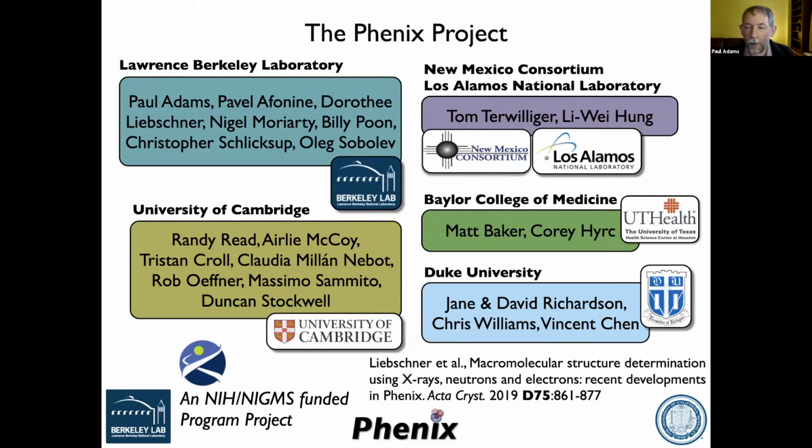And we all work on different parts of the structural biology problem. We originally started looking at crystallography, but as you can see, have expanded to other things. I'll remind you later on, but there is a new publication that describes recent developments in PHENIX, which is a great paper to read. This has been a collaboration for 20 years now, which is how we arrived where we are in terms of the PHENIX program. And as many of us would tell you, this collaboration is a really great thing to do. It's been one of the great things we've worked on over the last 20 years.